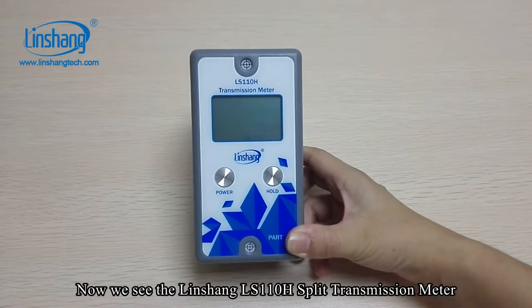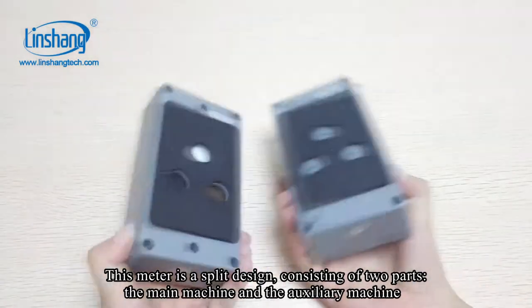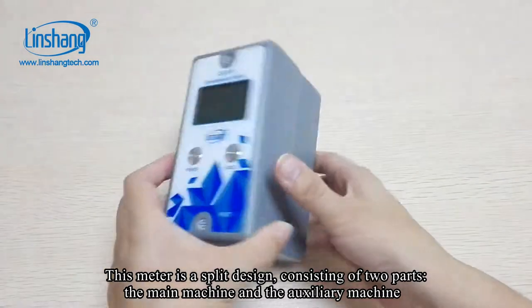We are now looking at the Linshang LS110H split transmission meter. This meter is a split design consisting of two parts: the main machine and the auxiliary machine.